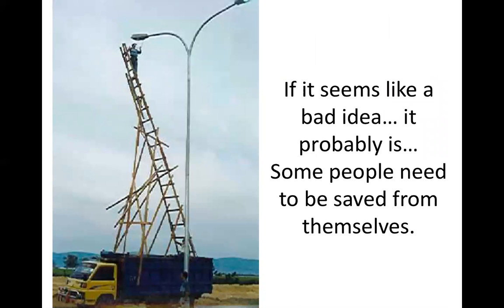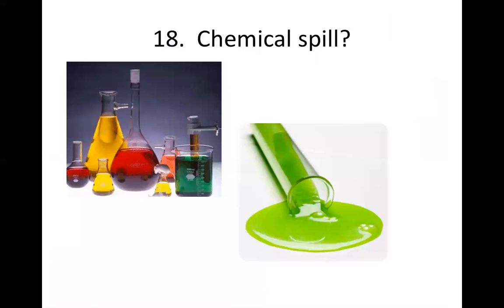And if it seems like a bad idea, of course, don't do it. You only do what's directed. And if you have some ideas that you think you can do, don't do it unless it's approved by the teacher. Okay? In case of chemical spills, you have to inform the teacher. You do not just mop it up with any kind of cloth or rag. Some acids can burn through clothing. So we have to use a specific kind of acid-resistant gloves to handle this chemical spill. So you have to tell the teacher, and the teacher will assist you or do the cleanup for you.